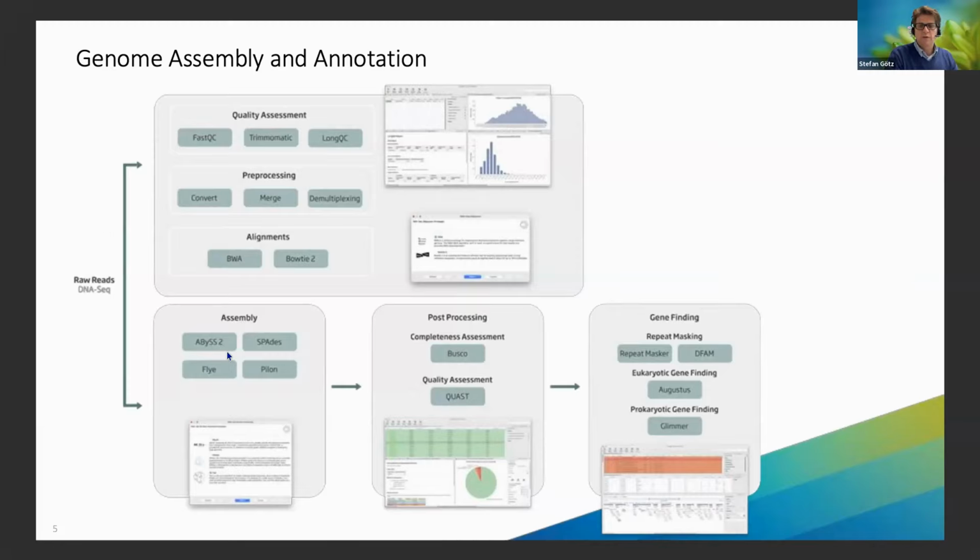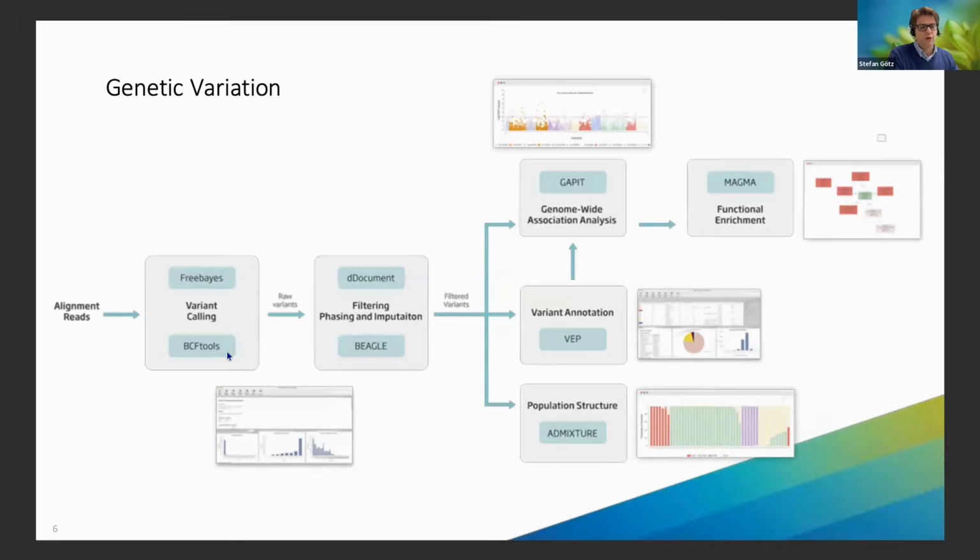So you have full transparency of what you're doing in each step until you really get to this biological insight, and then you can loop back around and rerun certain steps if you're not convinced about the parameters or about the output or about whatever you saw on all those many visualizations we have.